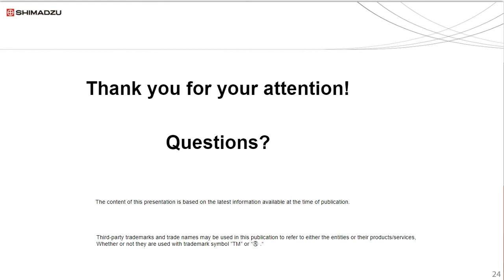Yeah, good question. So the next question is, if there's a repeatability problem, what could be the reason for this? Like arsenic, mercury, selenium, what would be your suggestions to resolve the repeatability problem? Sure, that's a great question. The first thing I would look at is whether or not the internal standard signal is stable or not. If that's jumping around, then it's a sample introduction issue, something with the peristaltic pump or the nebulizer, etc. If the internal standard is stable and it's the signal that's jumping around, that tells you some different information.